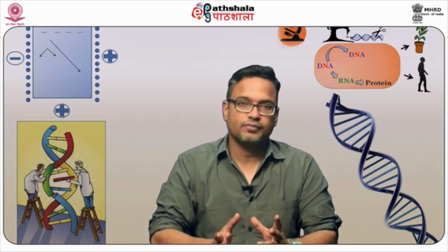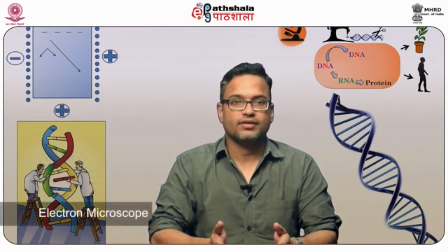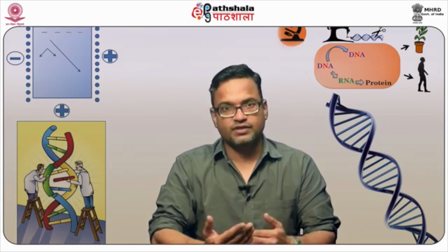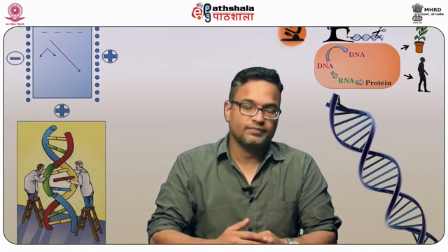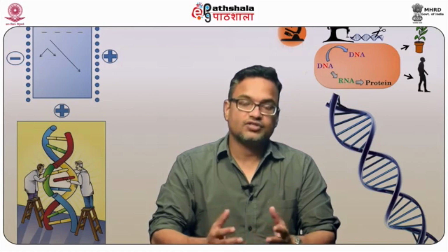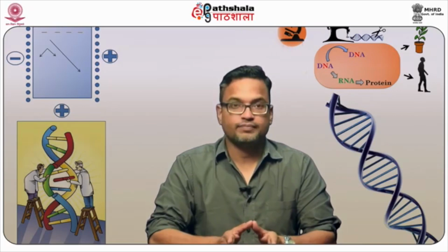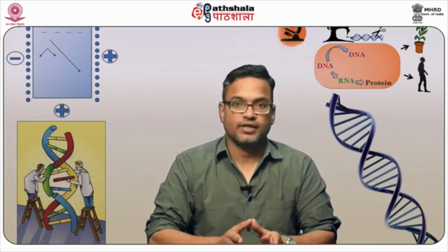Okay, so the types of microscope, as we mentioned earlier, there are 2 different kinds of microscope here: electron microscope and scanning probe microscope. These 2 microscopes are very different from the ones that we discussed earlier, and will be discussed in detail in a separate next module as well. So electron microscope basically utilizes an electron beam as a source of illumination compared to a light source or UV light, and they have 2 variants, either transmission electron microscope or scanning electron microscope.